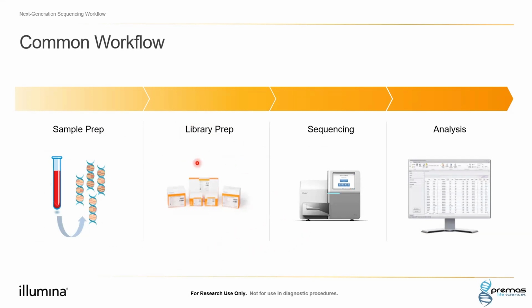It needs to be modified. So basically, because this is short read sequencing, the nucleic acids need to be fragmented, and they need to come to a certain range. After that, certain modifications, certain adapters are added to it, and then that is basically your library, and it is compatible to your sequencing platform.